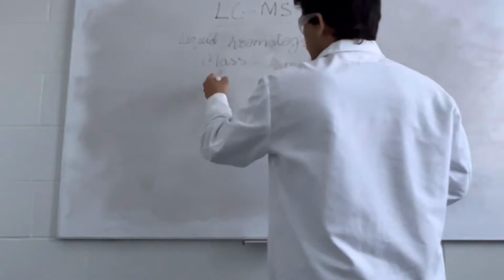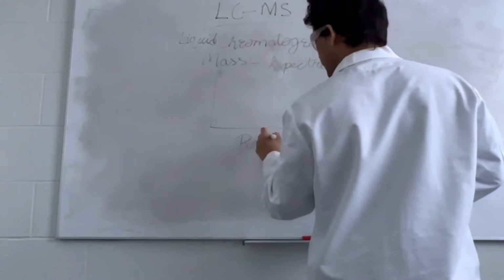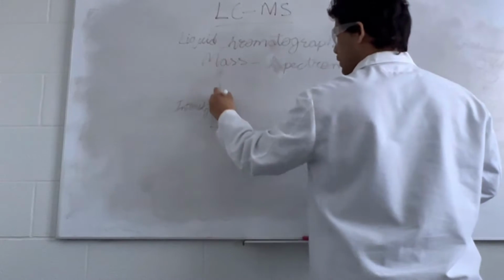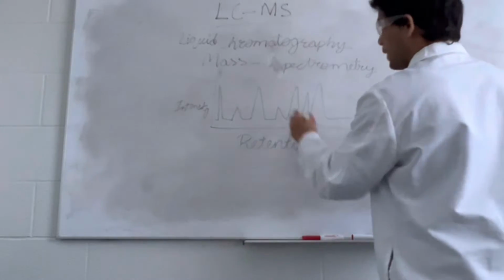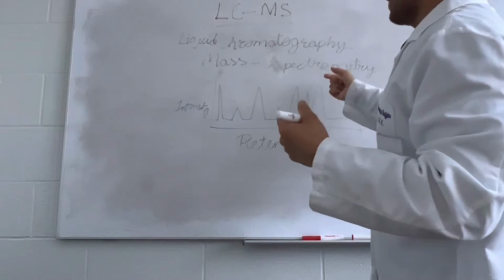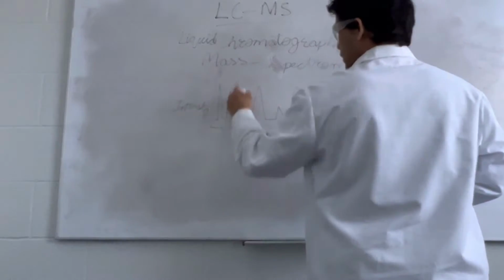This is an example of retention time. Usually a chromatogram might look like this when it is an LC-MS chromatogram, whereas if we directly throw the sample into the mass spectrometry, all of them might elute at nearly the same time.